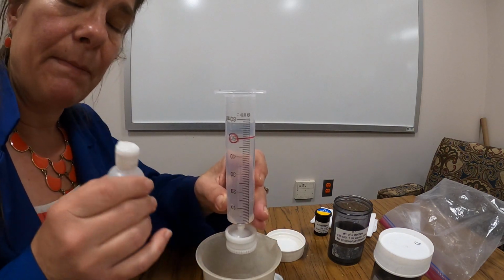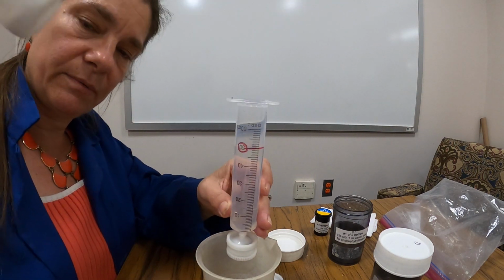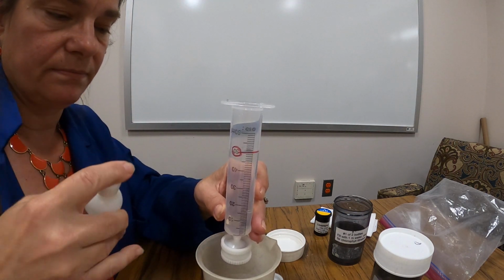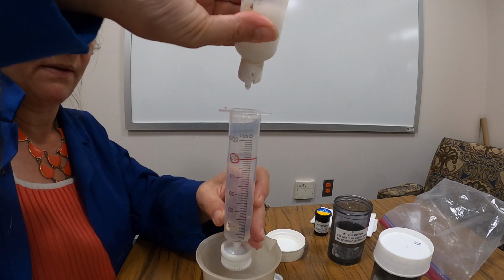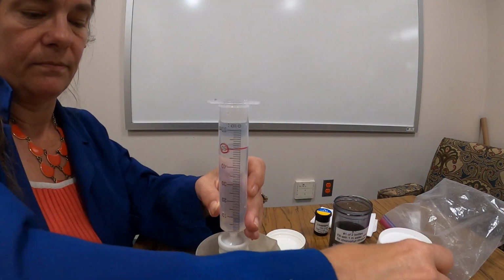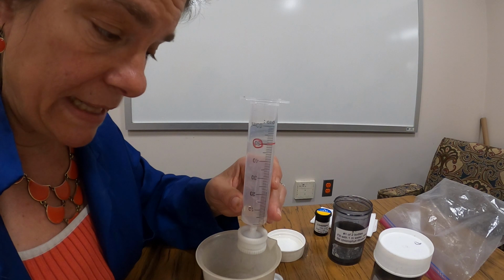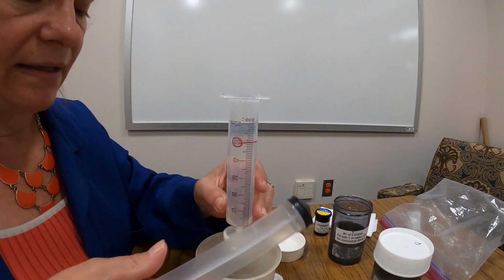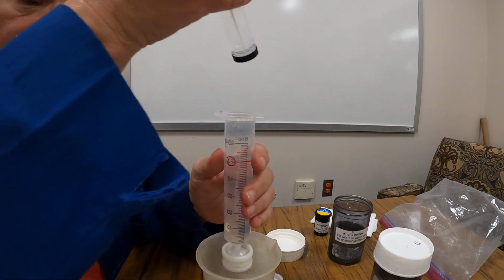Now I'm going to add about 4 drops of my magnesium carbonate. You can see that's kind of settled quickly, so I want to shake that up. And then just add about 4 drops. Doesn't have to be precise. But it is important that we add the magnesium carbonate because that's a preservative. And if it takes us a little while to get all of these filters analyzed, that can help us.